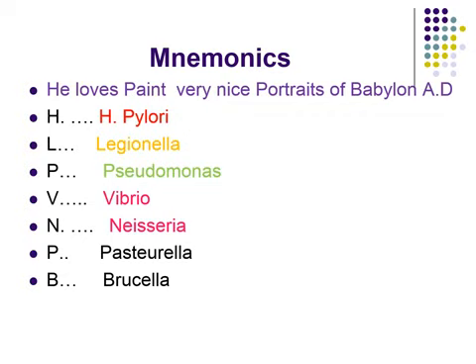Not only Neisseria species can give a positive oxidase test; many bacteria other than Neisseria species can.